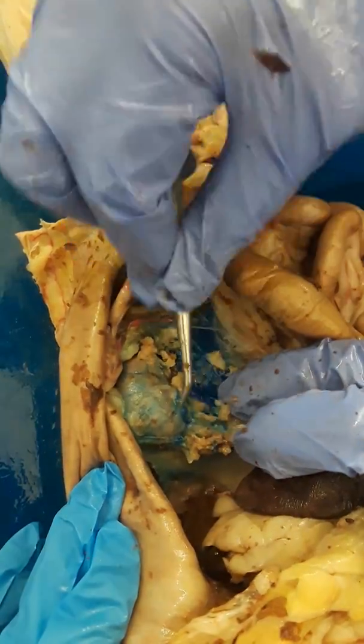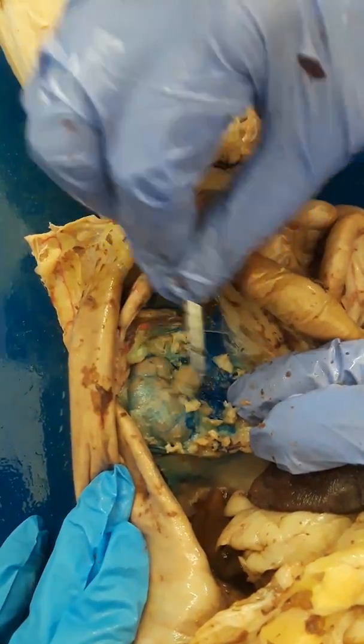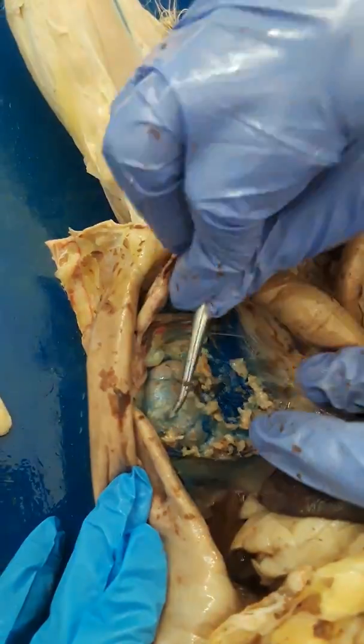And then the last organ that I want to show is the kidney, which is here. And there's one on both sides.